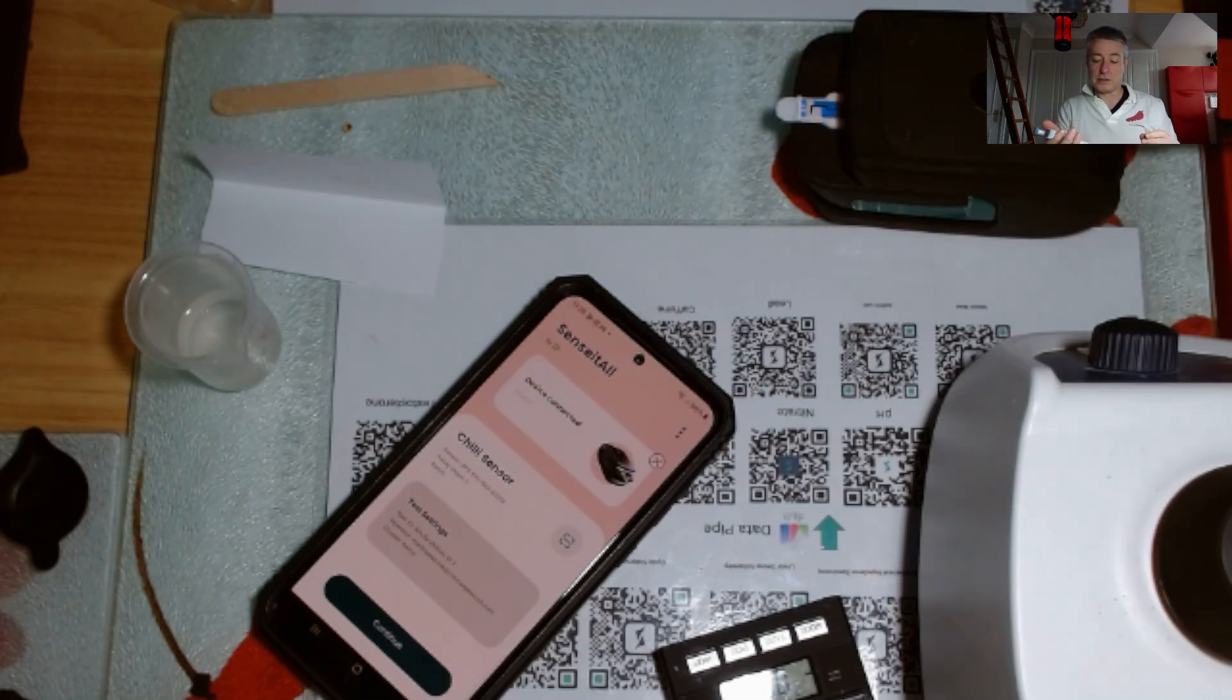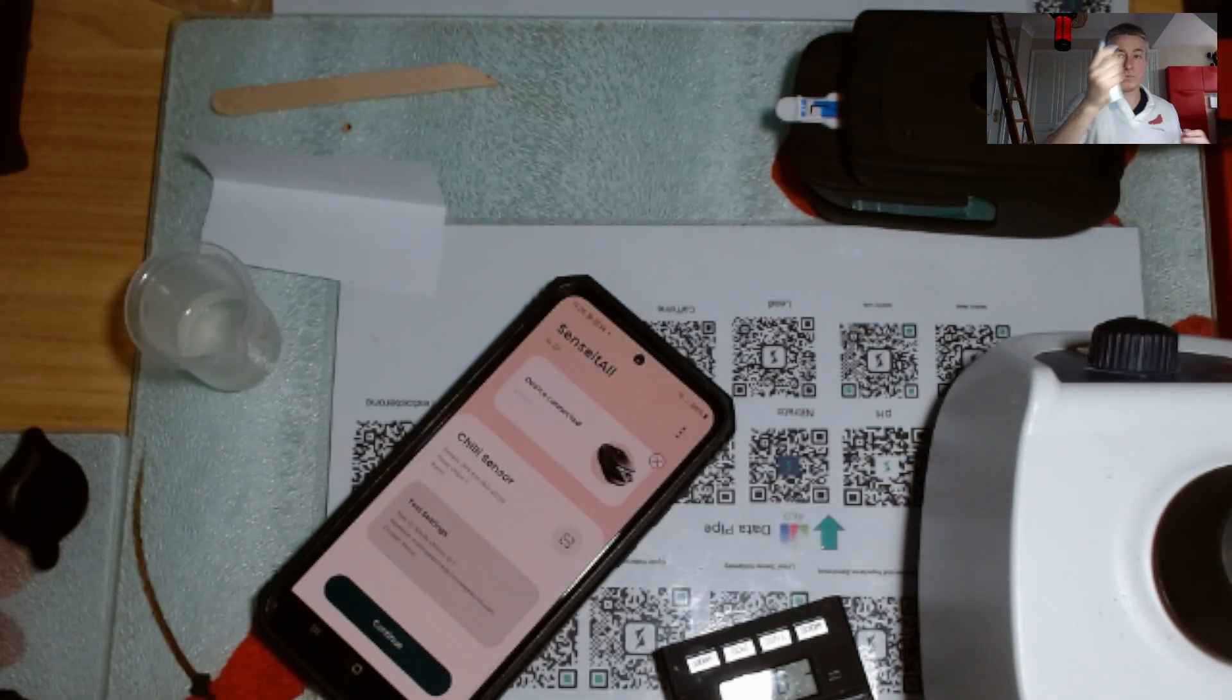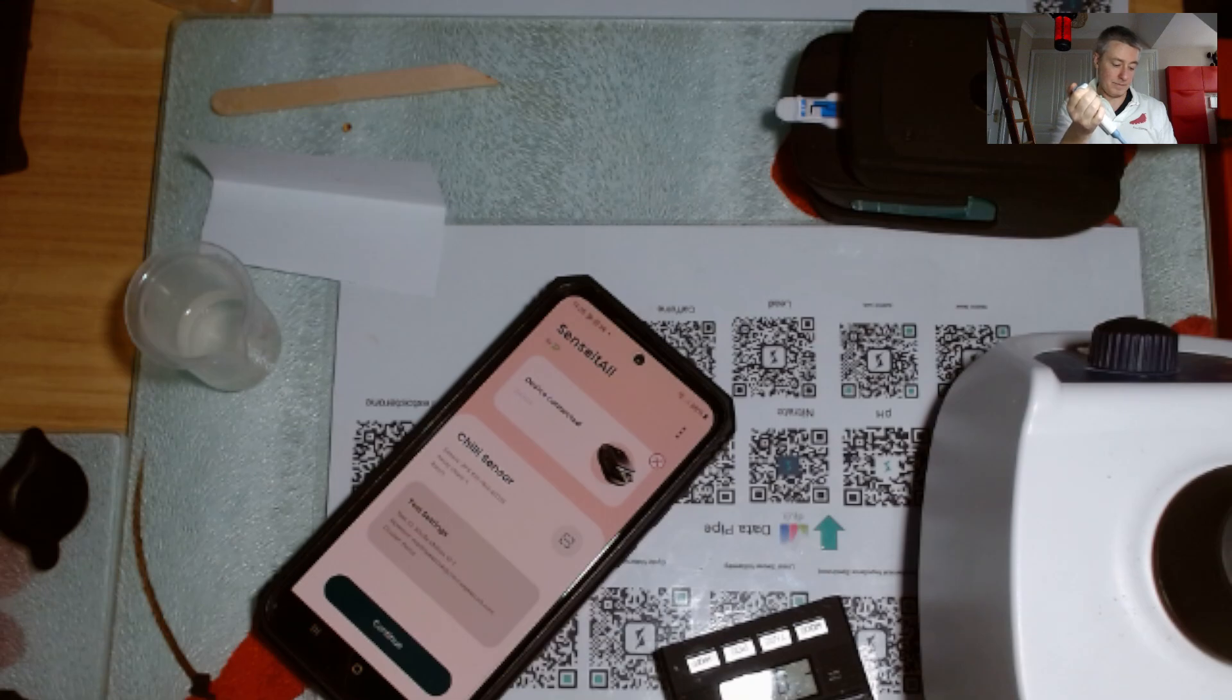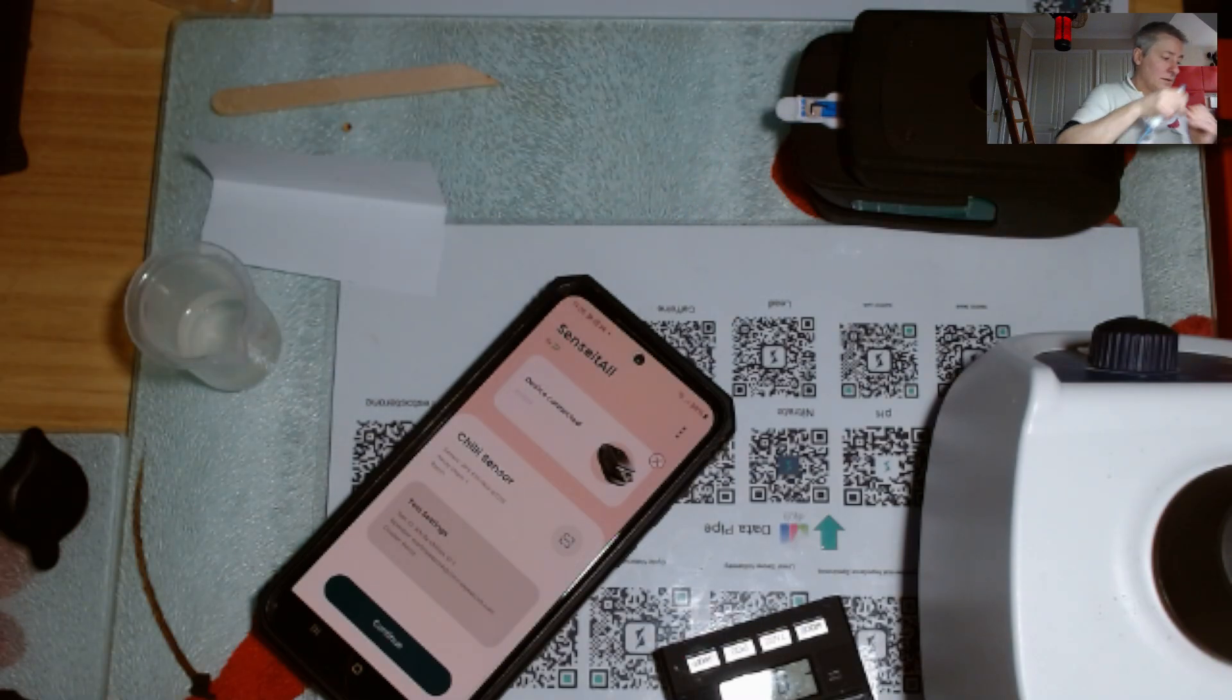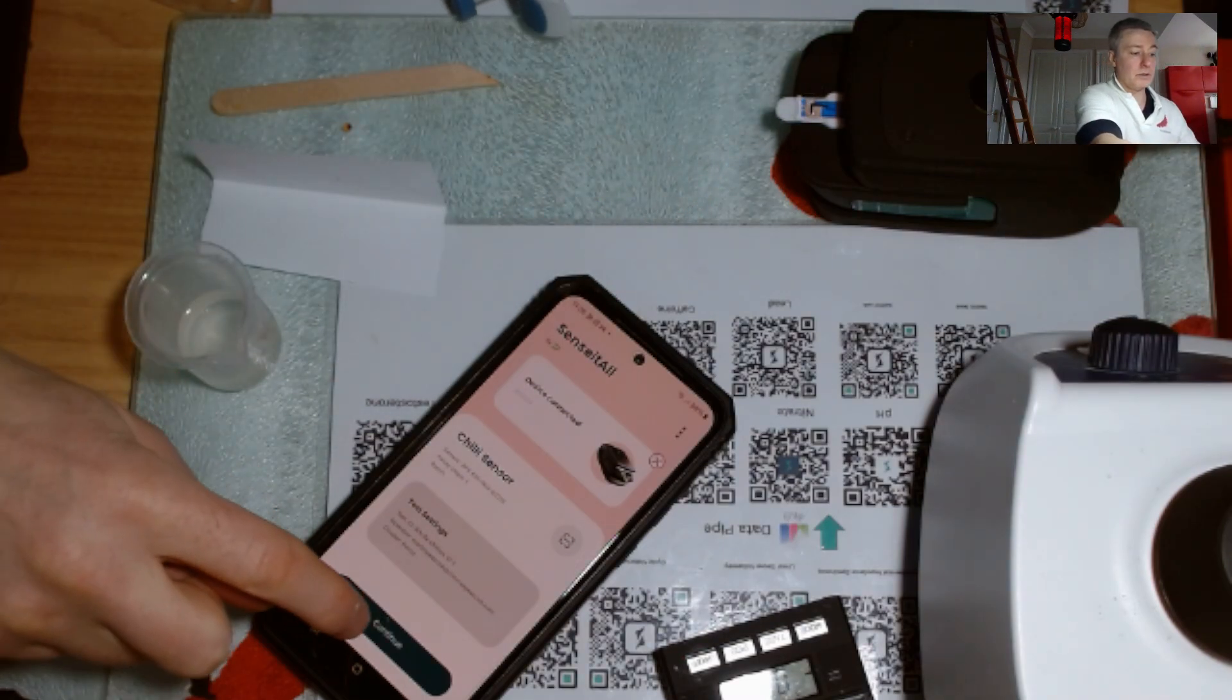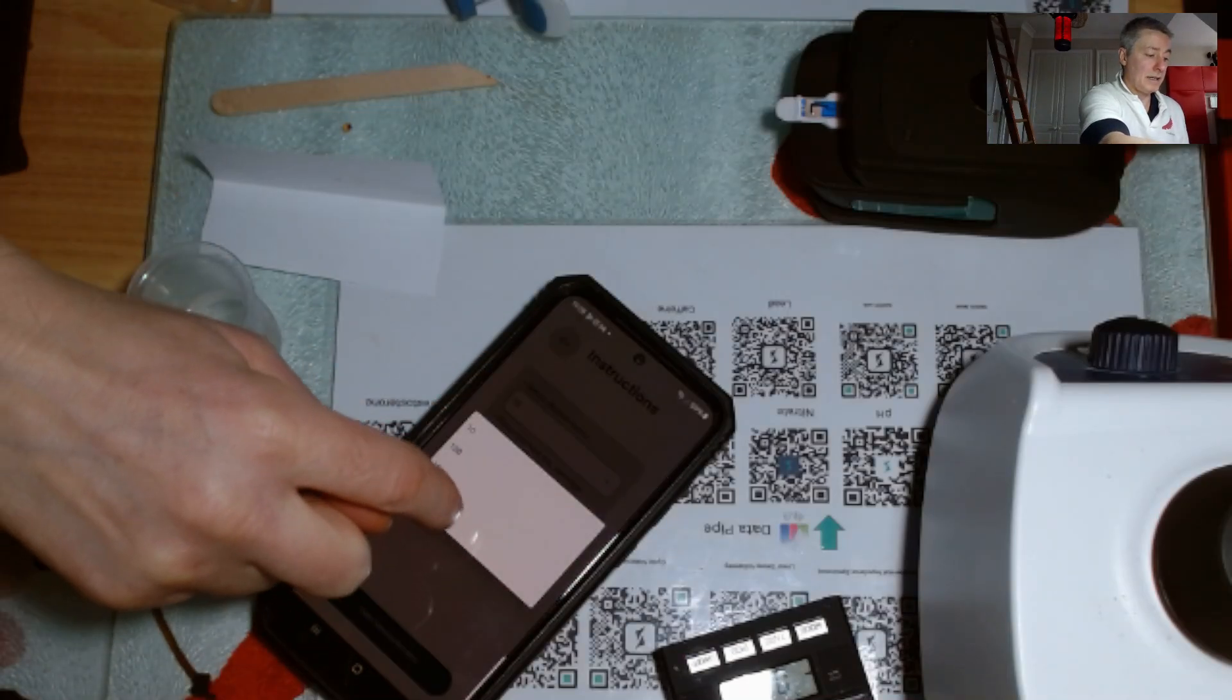I'm going to call it whole chilis and I'm going to call it 10 because I've only done what's really a one in 10 dilution. I'll come back now. Right, so I've done that. Now what I'm going to do is just give it a quick vortex. Now I'm going to take 50 microliters and I'll put it onto the sensor.